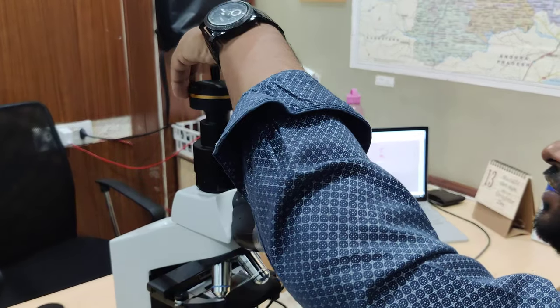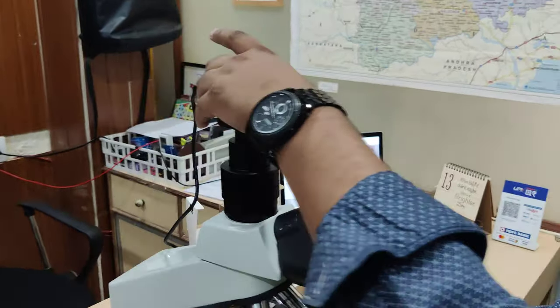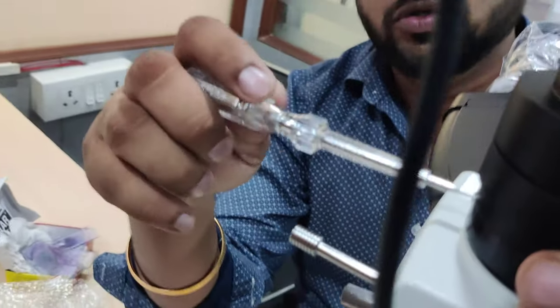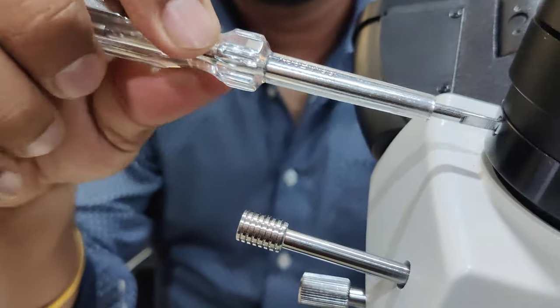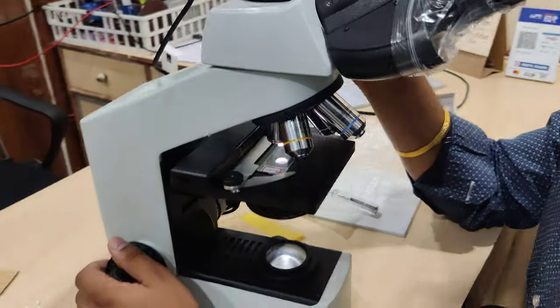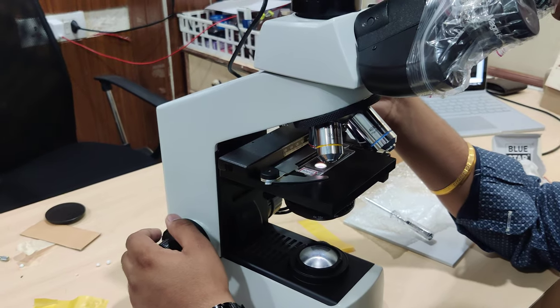Rotate it in such a way that the wire comes to the back side, so there is no distortion of light. Secondly, try to focus with the eyepiece by shutting the iris downward.